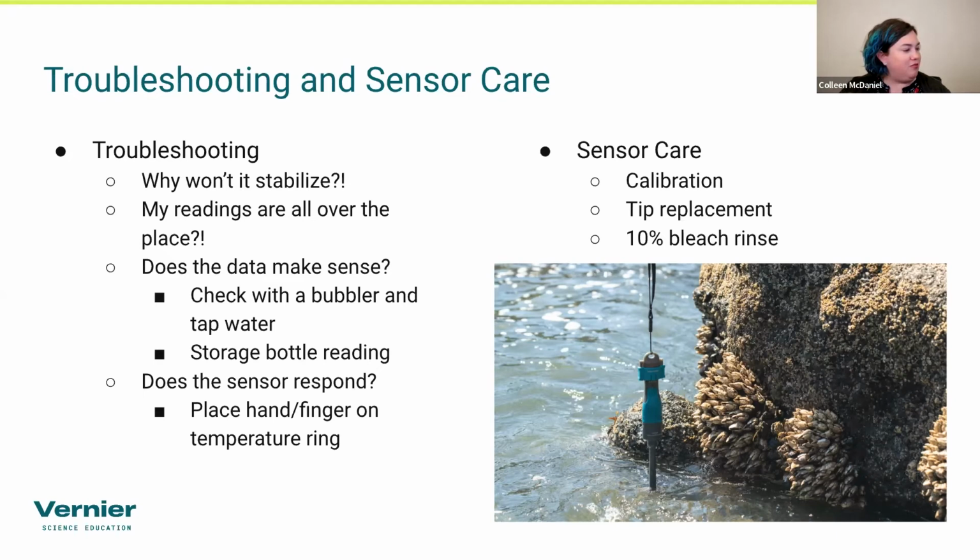Brett asks, does bright ambient light negatively affect the optical probe readings? Yes. With the BTA version, we have found that light can affect these, and that is why we started shipping it with that black light guard on it.